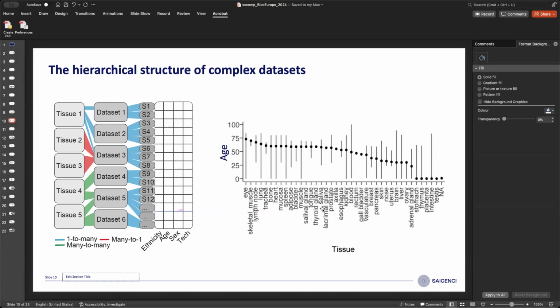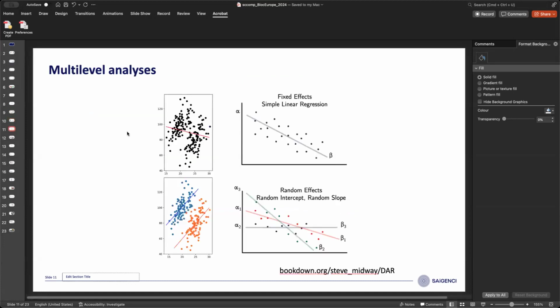And I will give you some example now. So a famous example is the Simpson paradox, where you have, this is quite simple, but I think, can you see it? It's still very small. You have two groups, yeah? And let's say you don't know, or you ignore those groups.